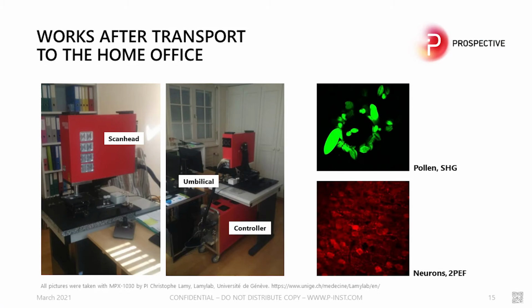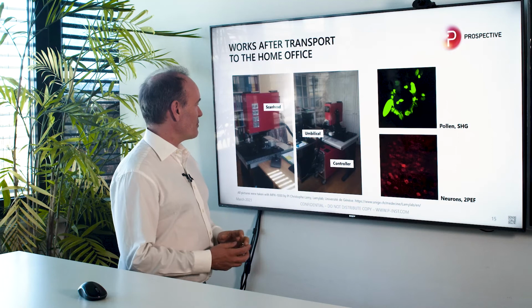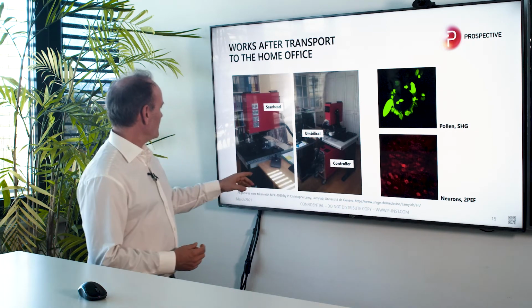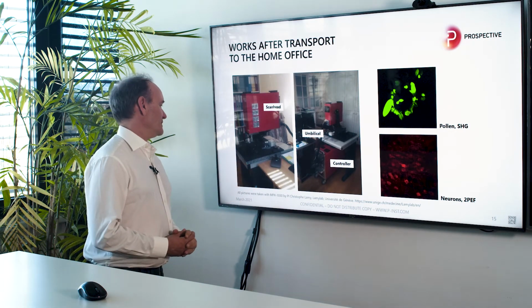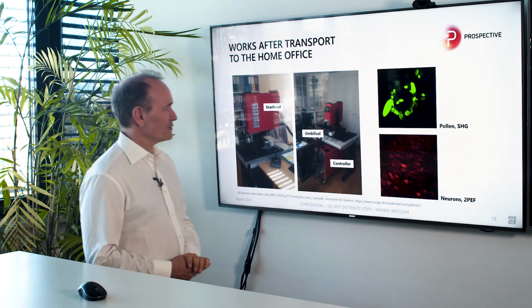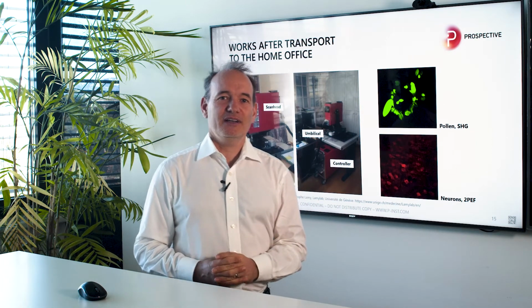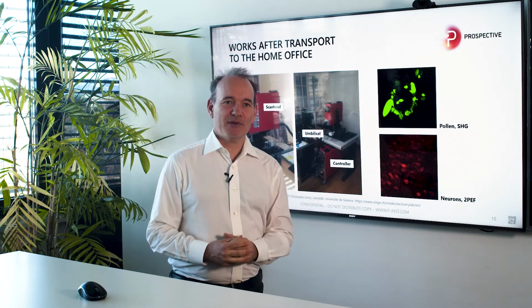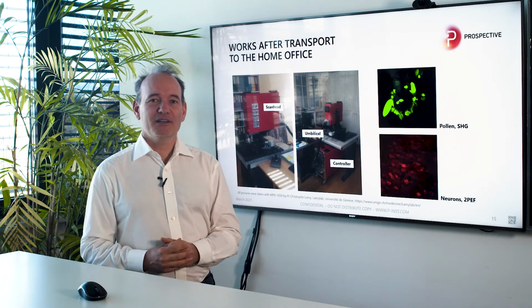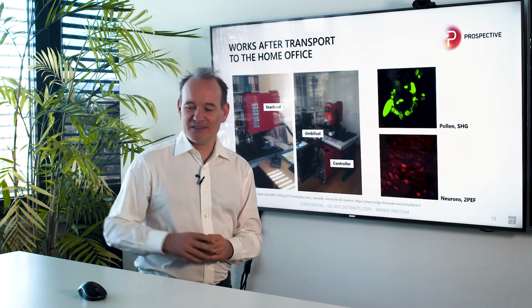The pictures are not that clear, but you can see here that the microscope works nicely in his own apartment. He installed it beside his bench, only adding a pretty solid table underneath the microscope. It works very nicely during the pandemic, and he can continue his work in his apartment with a two-photon microscope. Probably this was the only two-photon or multi-photon microscope installed in an apartment worldwide.